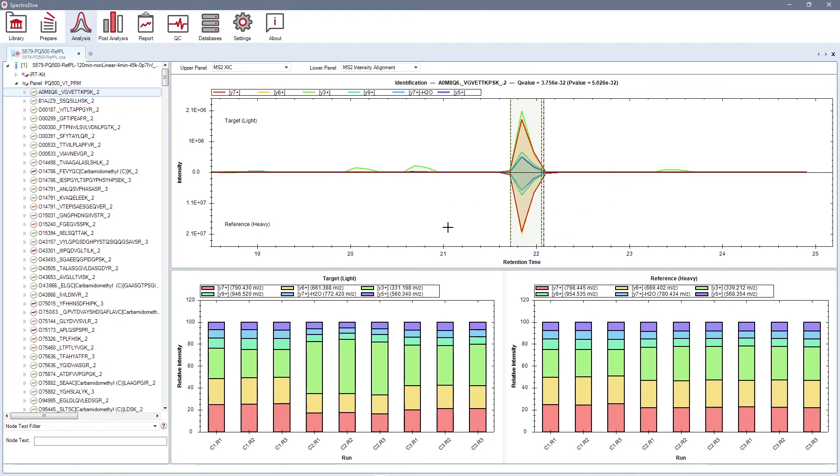On the lower panel, you can see MS2-intensity alignment plot that gives detailed information about the signal stability across several runs and helps to identify inconsistent ones.